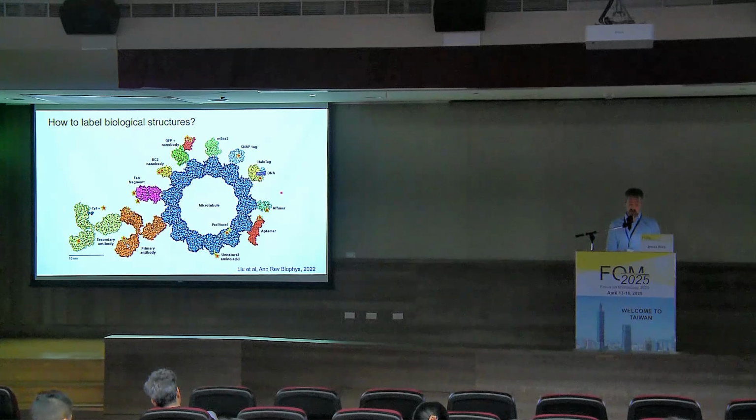If you want to be even smaller, if you're lucky, you find a molecule that directly binds the protein of interest, like phalloidin for actin or paclitaxel for microtubules. Or you can do something like genetic code expansion and use unnatural amino acids to replace individual amino acids by a clickable version to which you can then attach a fluorophore. But this is still quite cumbersome to do, and it's difficult to do it stoichiometrically, to have it at the endogenous level.